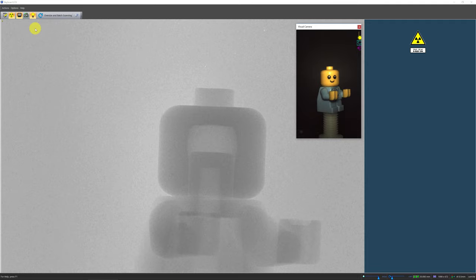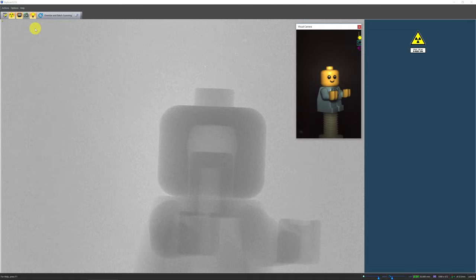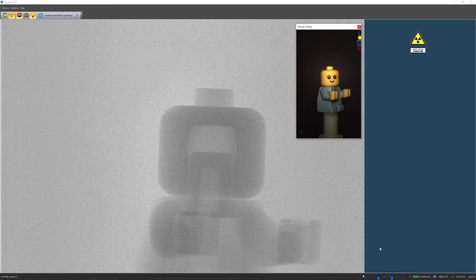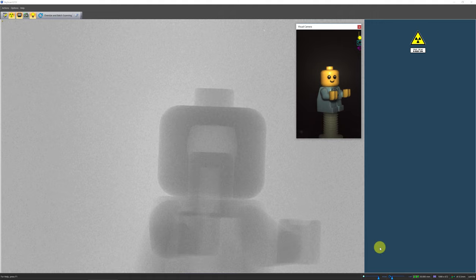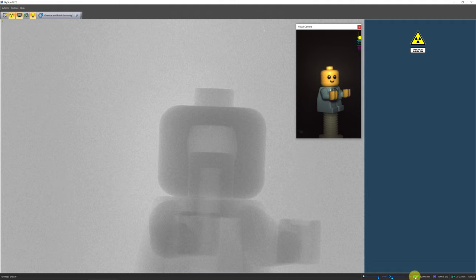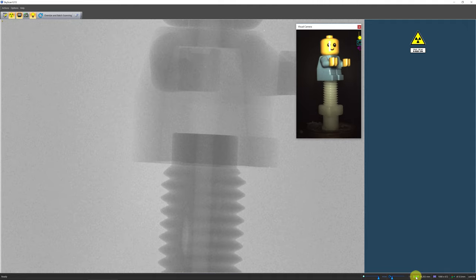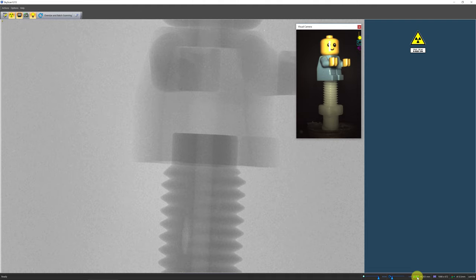After turning on the x-ray and starting to capture the transmission signal, next we are going to put the sample in the middle of the field of view and align the rotation axis of the sample to the center of the detector. There are three different methods to adjust the elevation of the sample manipulator. The first method is by moving to the status bar and pressing the up or down arrow by holding the left mouse button in the elevation column — the sample manipulator will move continuously until the arrow is released. However, it is difficult to move to a precise location with this method.